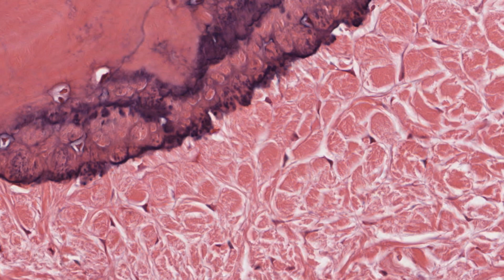It's worthwhile examining the ligament with some care as it's been cut in various orientations across the section. In particular, with a bit of perseverance, I've found some transverse sections. Here you can see how large the bundles of fibres are. They form a mosaic pattern with the fibroblasts or fibrocytes squeezed in between them. By the way, this is what a tendon looks like in cross-section. Maybe you should go back and compare it with the longitudinal section of a tendon, which is dense, regular connective tissue, that I described in my earlier lecture on connective tissues.